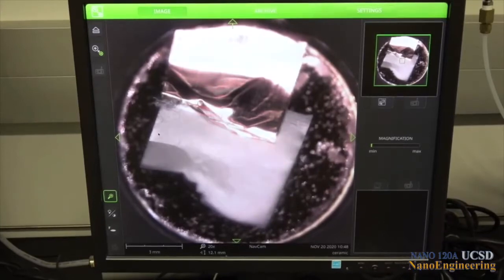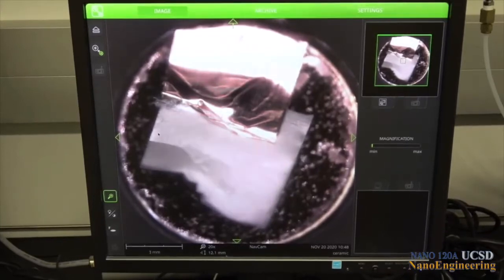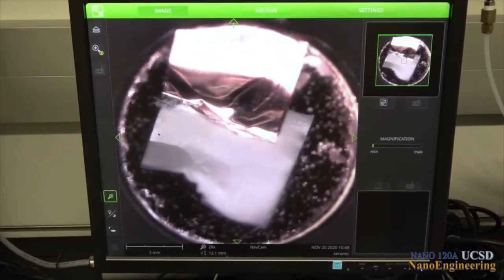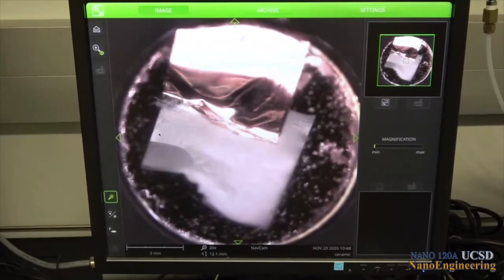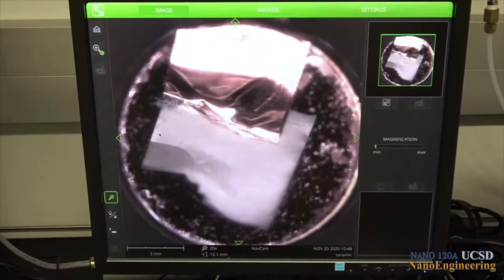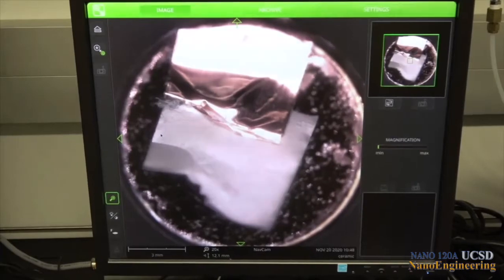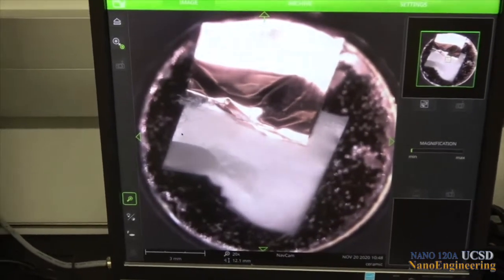When the specimen is first placed into the microscope, it is first viewed by an optical navigation camera capable of producing color images up to 135x magnification. This is useful for identifying locations on your sample or perhaps even identifying samples of interest if multiple specimens are present on the aluminum mount.